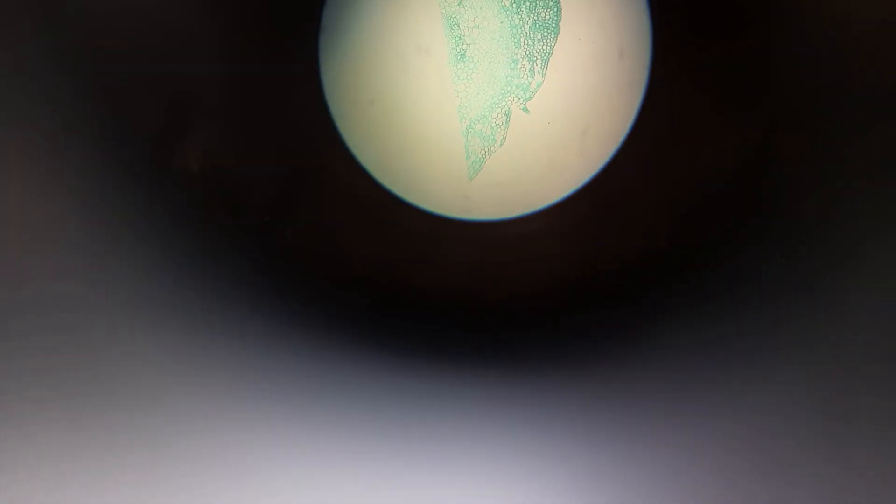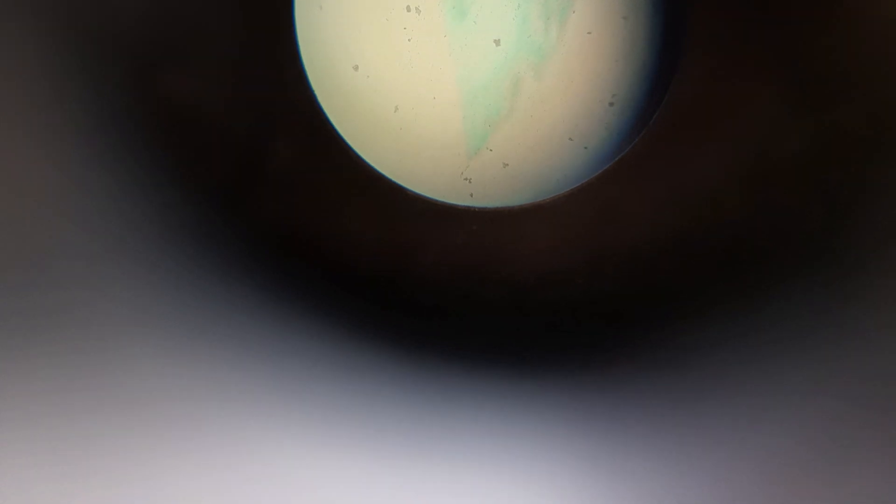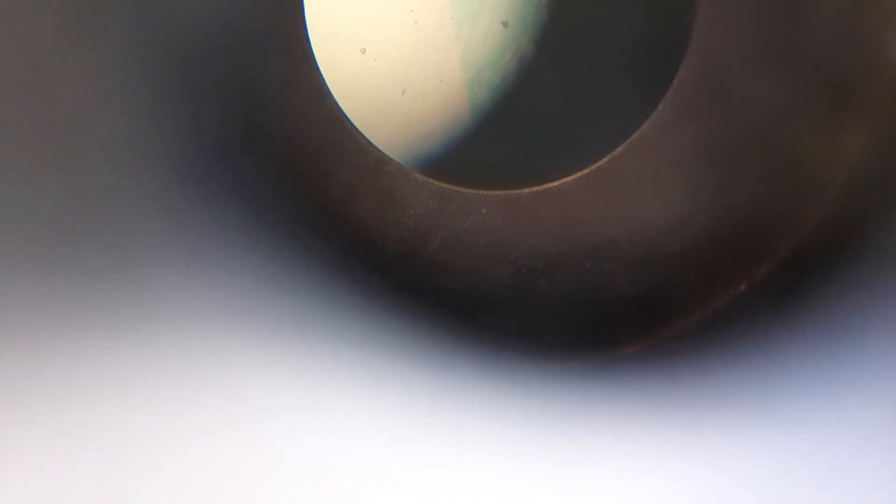Sclerenchyma is a dead tissue because you cannot see protoplasm in this tissue. Only the cell wall is present with a large vacuole, which is actually not functional and is called lumen.